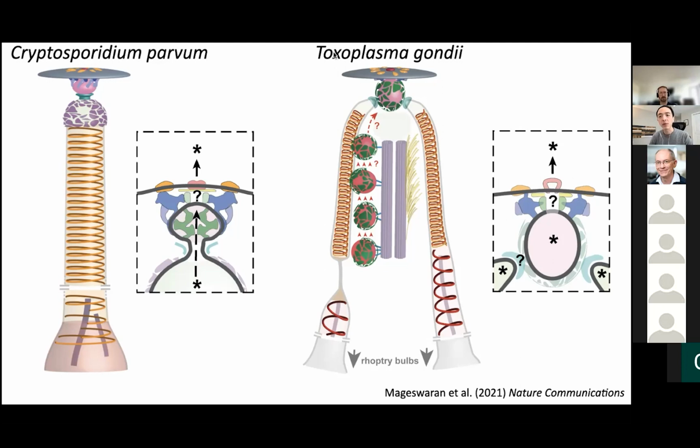We think there's only one RSA and one AV at a given time. And then on that single RSA and AV, we always only see 2 rhoptries docked to them. But who knows, we don't know that once the whole thing disassembles upon secretion, whether those components are being recycled back together to become the same RSA and for docking the next AV, or there will be another rosette formed by another set of proteins. So we don't know.